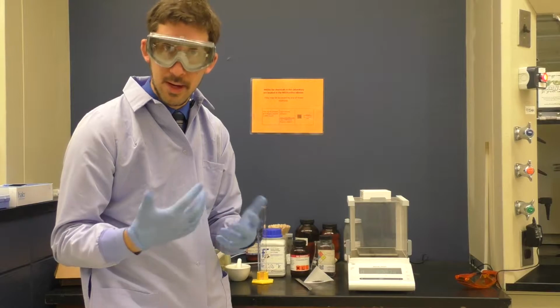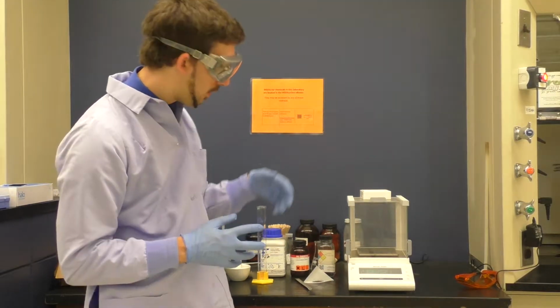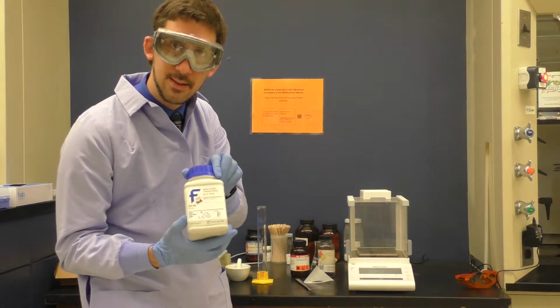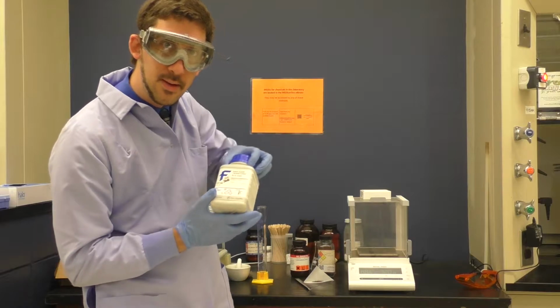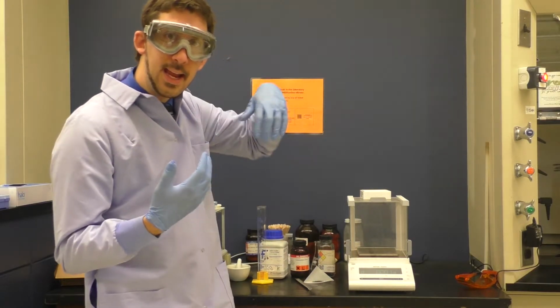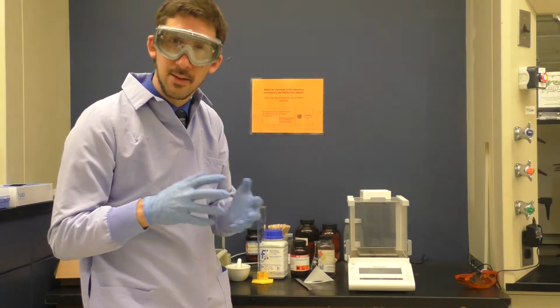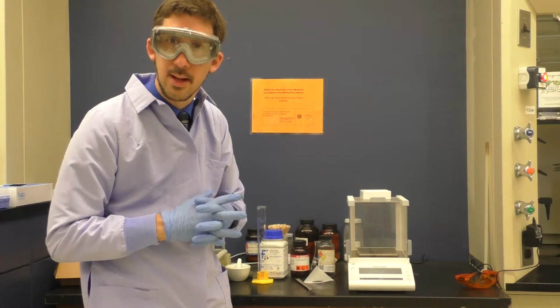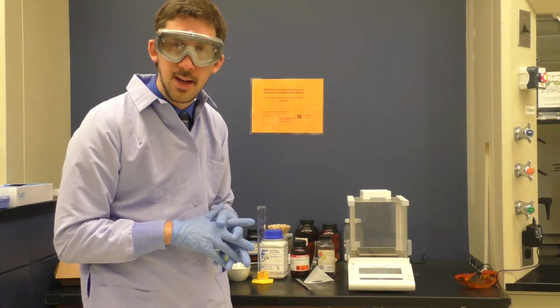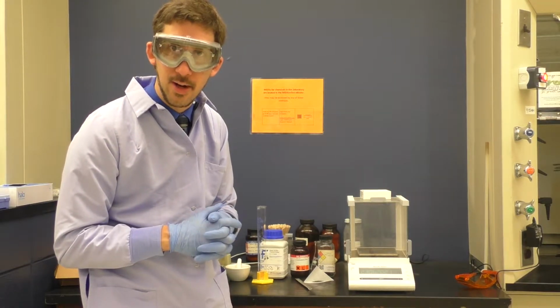Now, in order for the amine to react, the amine can't be protonated anymore, so we're going to have to weigh out some sodium acetate. We'll make up a solution of this. We'll add that solution in. That sodium acetate will help deprotonate the protonated amine and leave you back with the 4-aminophenol, and that sodium acetate will also help facilitate proton transfers in the reaction. But then that will leave the amine free to react with the acetic anhydride.